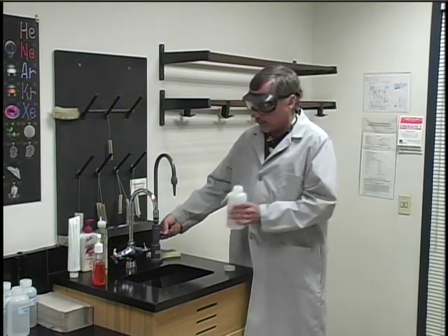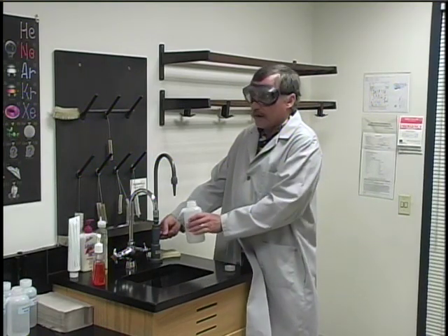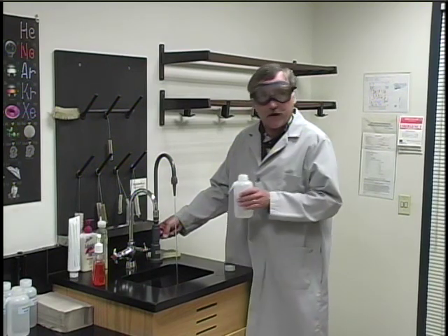When you do go to fill the bottle, you need to turn this handle very slowly because the water comes out rather quickly, and if you turn it too far, you might end up with an accidental safety shower.